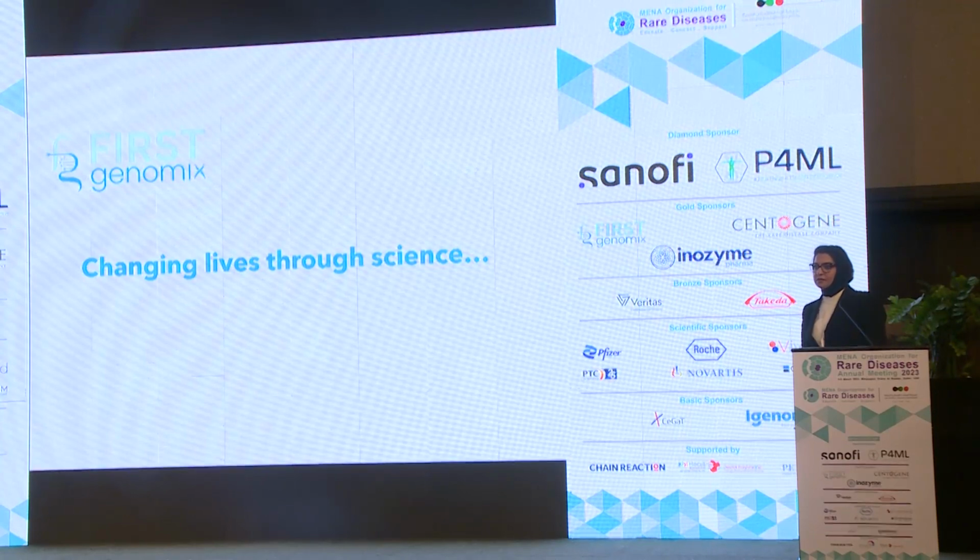So these were just some examples of what we do in our lab and how we deal with the cases, whether it's direct, which every other lab is offering, or indirect. I just want to remind the doctors that the analysis is different if you request whole exome sequence screening or diagnostic. The screening is mainly automated in most labs and clinics. That's why the first case was missed: the variant is not loss of function, so it was not reported.